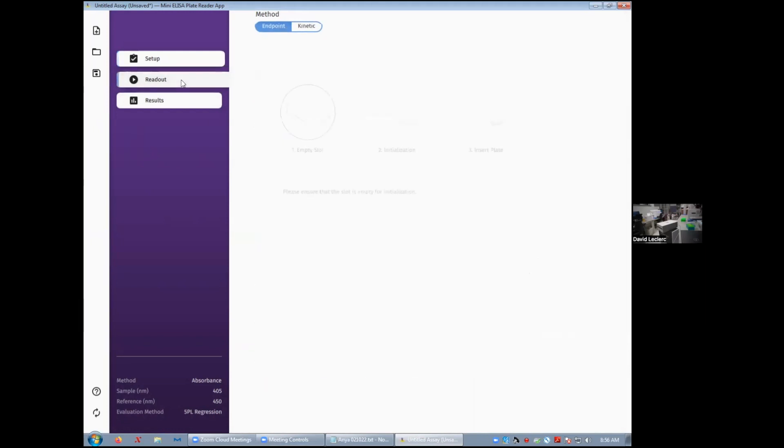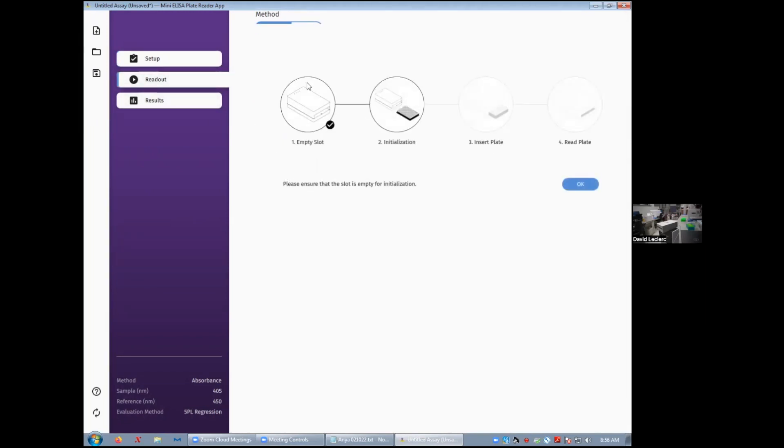So once you've done that, let's go to readout, and now we're going to prepare the instrument. The first step is making sure that the plate reader is empty. There's no plate in it. Then simply click on OK to proceed to the initialization.